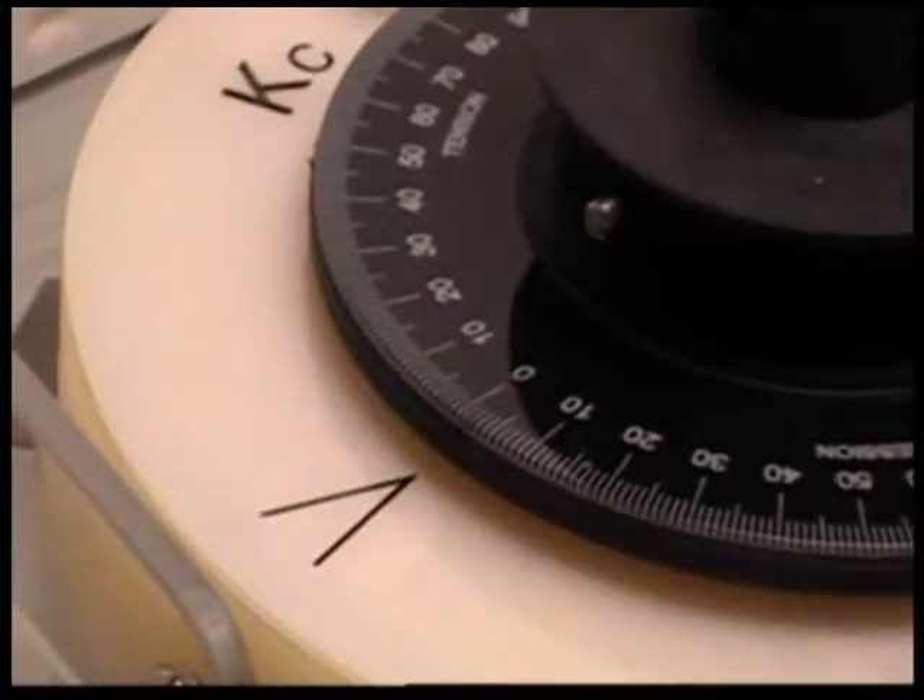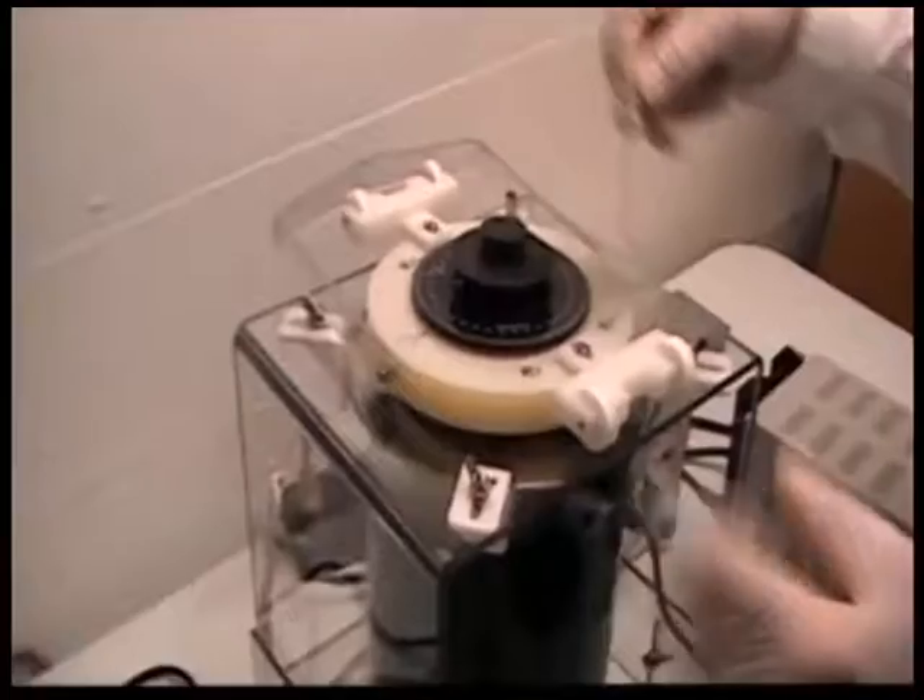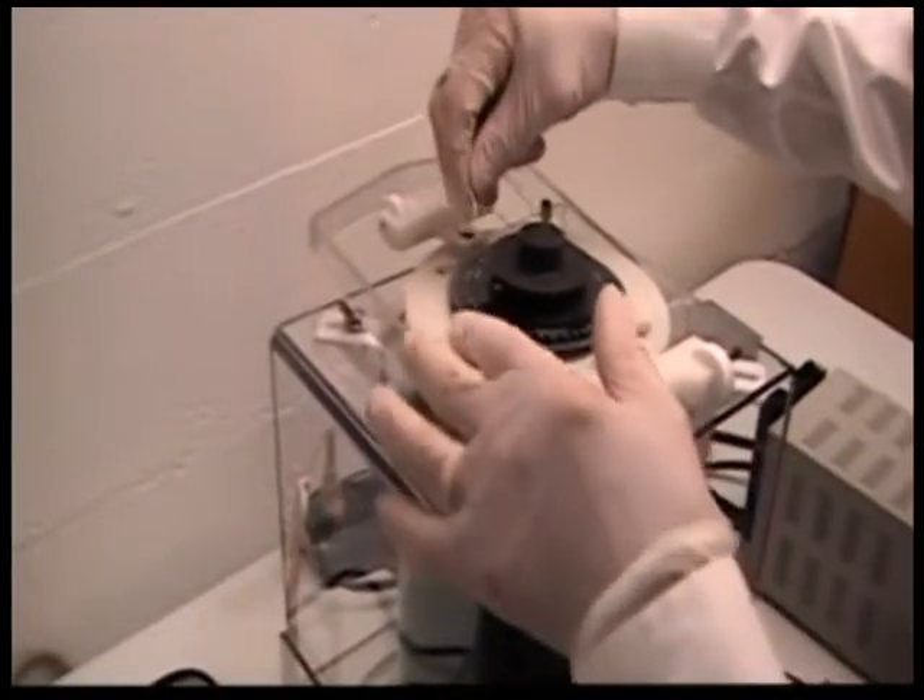Normally tap to get the arrow lined with the zero. If you use a finger, the finger motion can influence the reading, so tap with a blunt instrument. If it doesn't quite get the zero, adjust it to the zero. The zero is now lined up with the arrow.